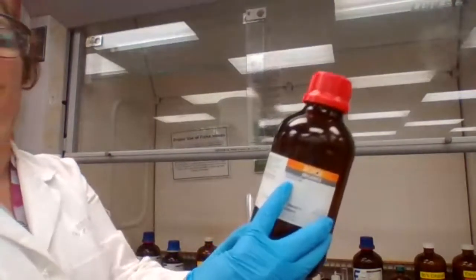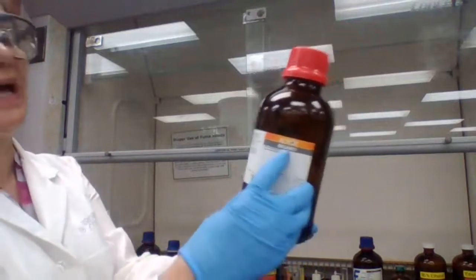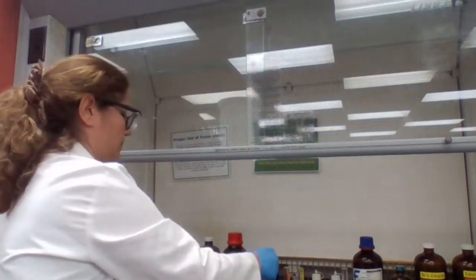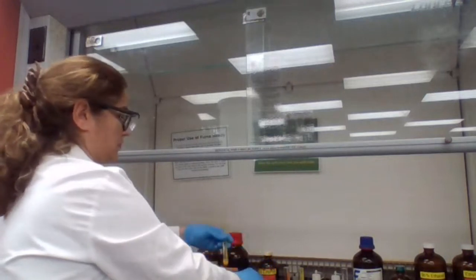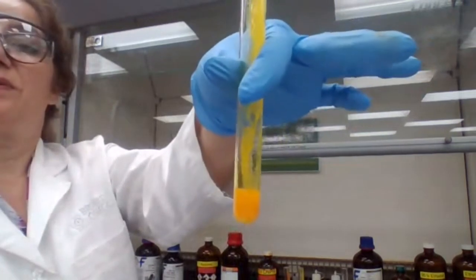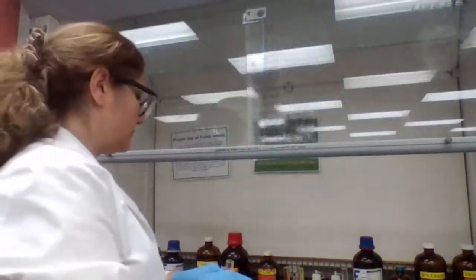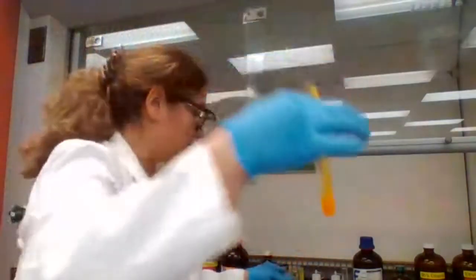Butyraldehyde is very small. You won't be able to see it, but I'm just showing the label in case you can see. Butyraldehyde plus the DNP. That's the positive test for it. The orange one, the second one, was acetophenone. And this is the aldehyde, butyraldehyde.